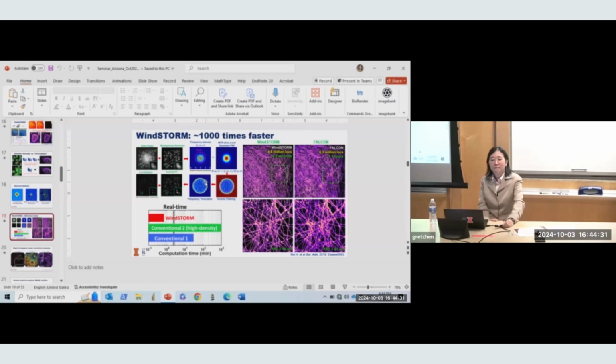Any other questions? I was wondering, when you were talking about developing the mesoscale microscope with the larger objective, you showed an image with a lot of field curvature around the edges, and you talked about trying to account for that or compromise for that. What techniques do you use to account for the curvature out at the edge of the field, and how accurate is that?